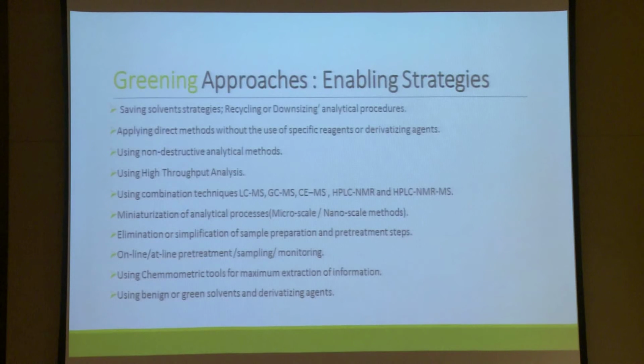We can eliminate or simplify the sample pre-treatment steps. Always use online or at-line pre-treatment, sampling or monitoring. Use chemometric tools, if possible, to get maximum extraction of information from the given data. Also use green or benign solvents and derivatizing agents.